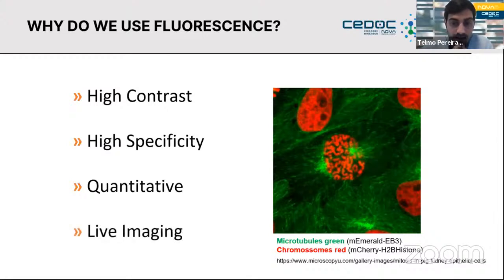Last but not least, all this is compatible with live imaging. So it allows you to see the dynamics, it allows you to see proteins of interest, it allows you to see many things by just recording a time lapse and seeing the behavior of your system.